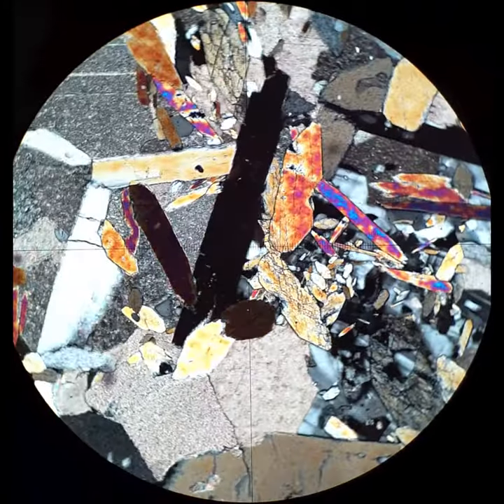There are also some prisms that are lying down within the plane of the thin section. Those are the ones that have those intense interference colors, the blues and oranges and magentas.